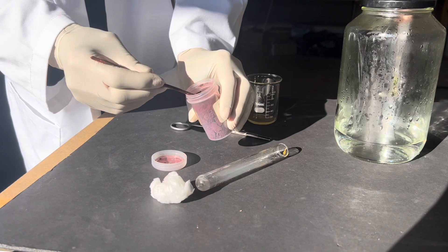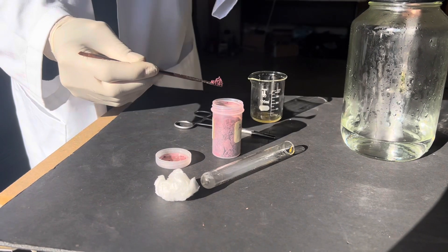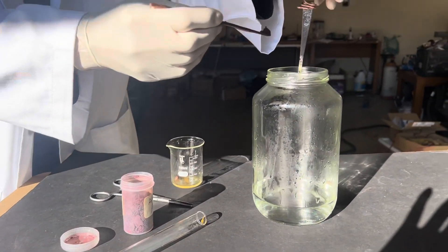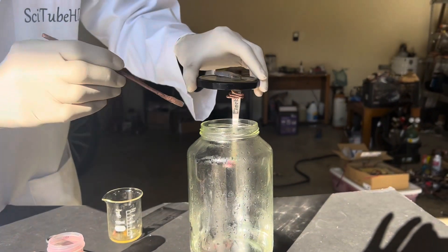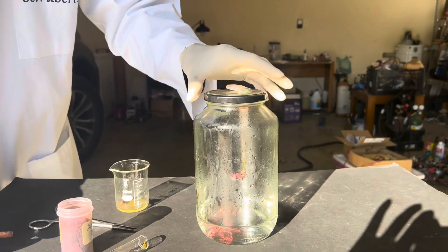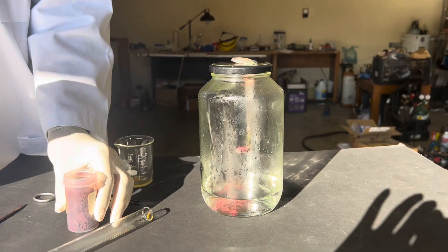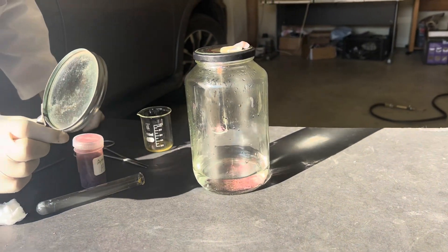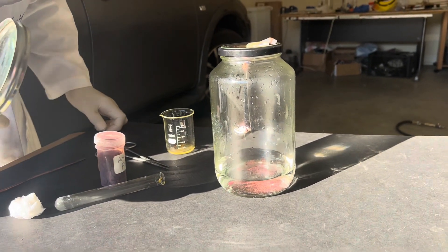Now let's try the same thing with the amorphous allotrope. Here it is. In order to get this to start burning we're going to have to heat it up using a magnifying glass.